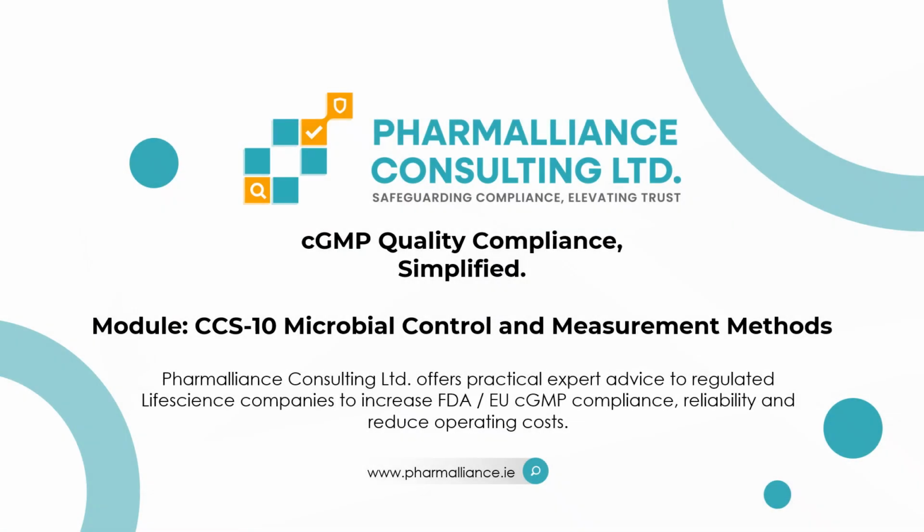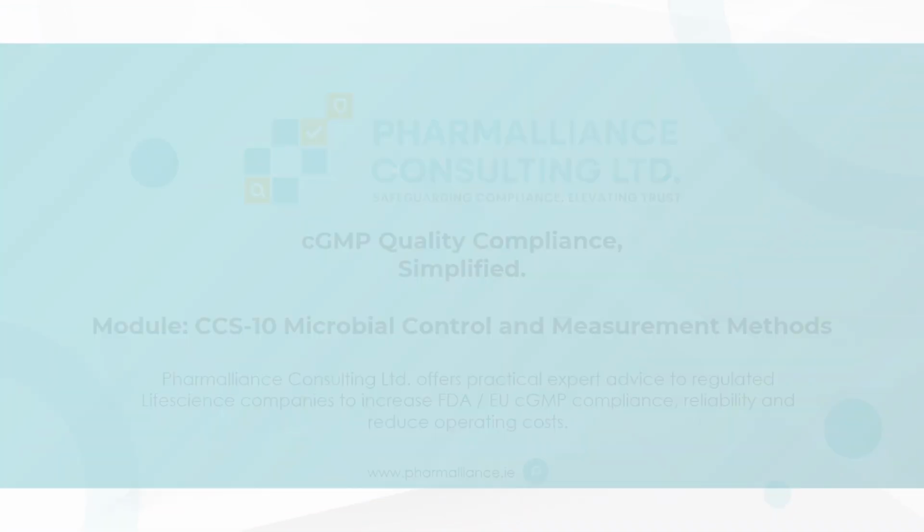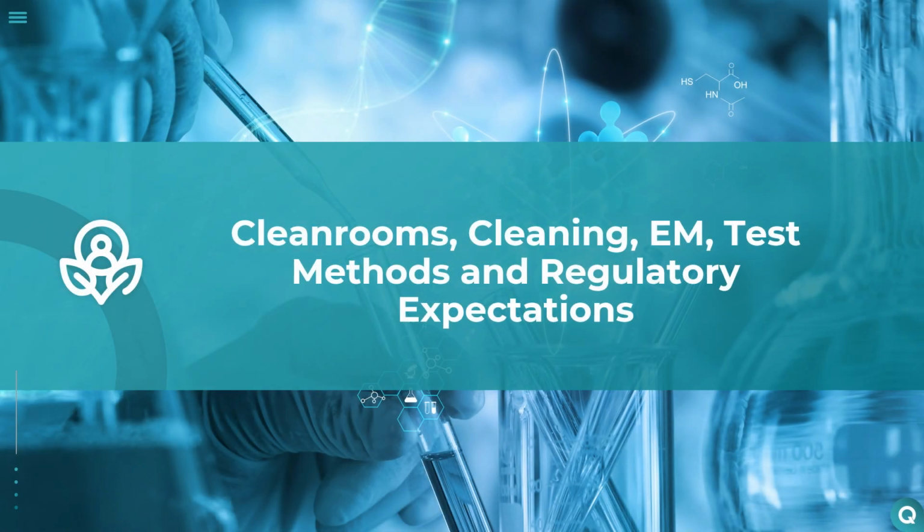Hello and welcome to Module CCS10 on Microbial Control and Measurement Methods. This session will discuss clean rooms, cleaning and disinfection, environmental monitoring, test methods, and regulatory expectations.